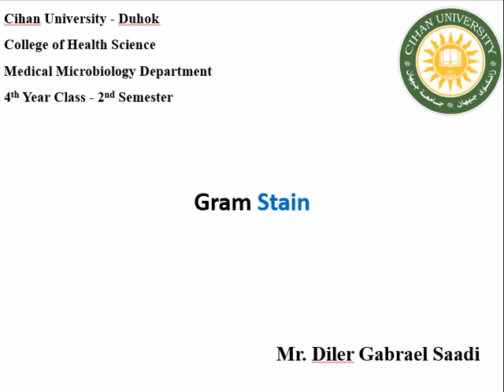Hello everyone, today's lab will be about Gram stain. First, Gram stain is one of the most fundamental and widely used staining techniques in medical microbiology. This technique differentiates bacteria into gram-positive and gram-negative groups based on differences in the structure and composition of their cell walls, particularly the thickness of the peptidoglycan.